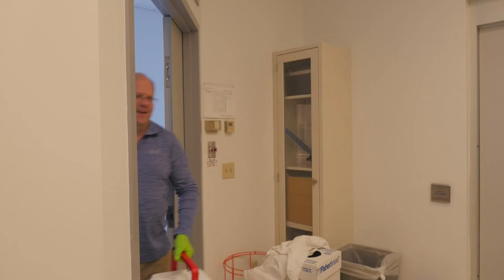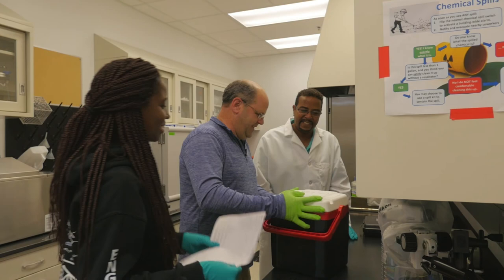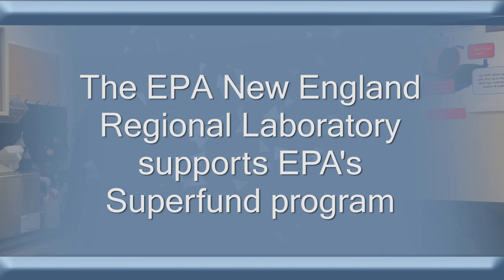For example, if we have a site or project where they need some sampling taken, we will go out and collect samples in the field, either soil, air or water samples. We can then bring those samples back to our regional laboratory and analyze them for any variety of different chemical or biological contaminants.